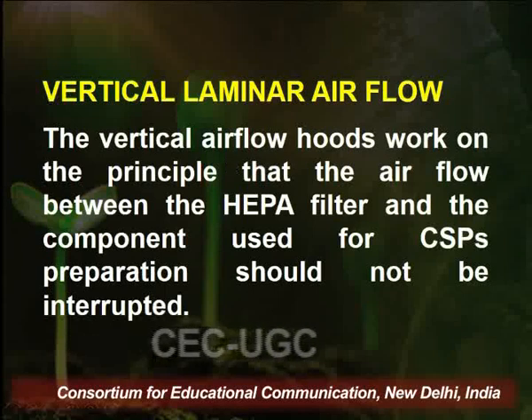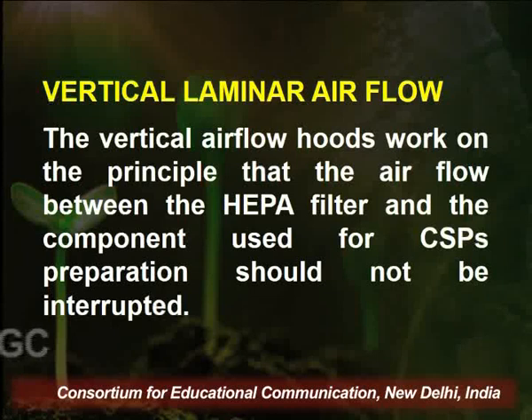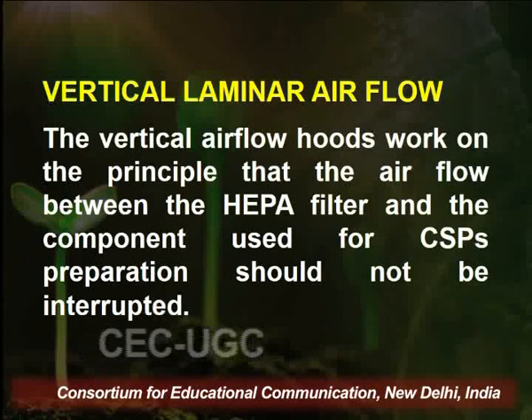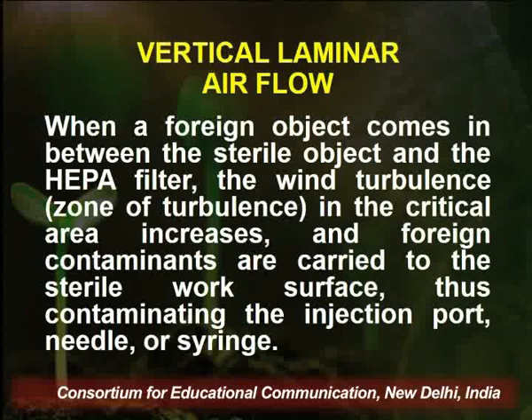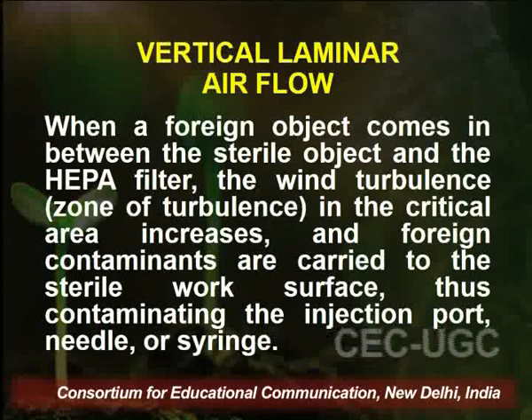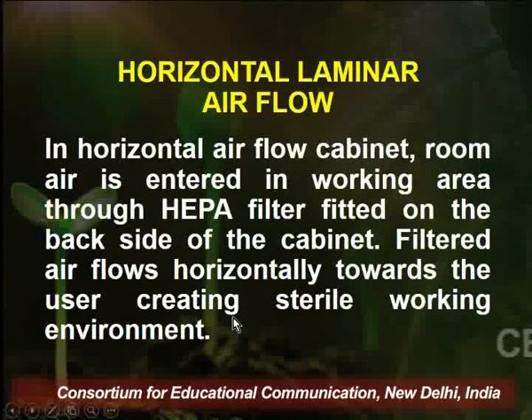The vertical flow hood works on the principle that airflow between the HEPA filter and the component used for CSP preparation should not be interrupted. When a foreign object comes in between the sterile object and the HEPA filter, the wind turbulence in the critical area increases and the foreign contaminants are carried to the sterile work surface, thus contaminating the injection port, needle or syringe. So this is avoided through another type of airflow, that is horizontal laminar airflow.